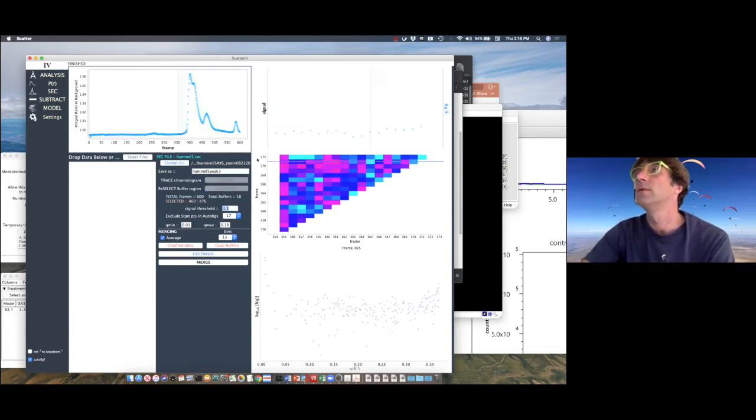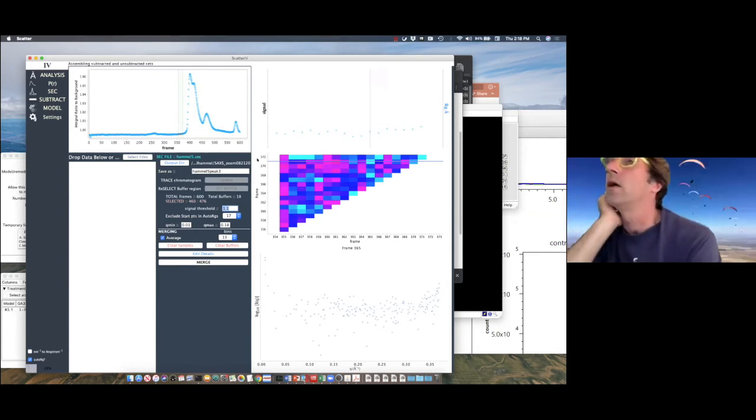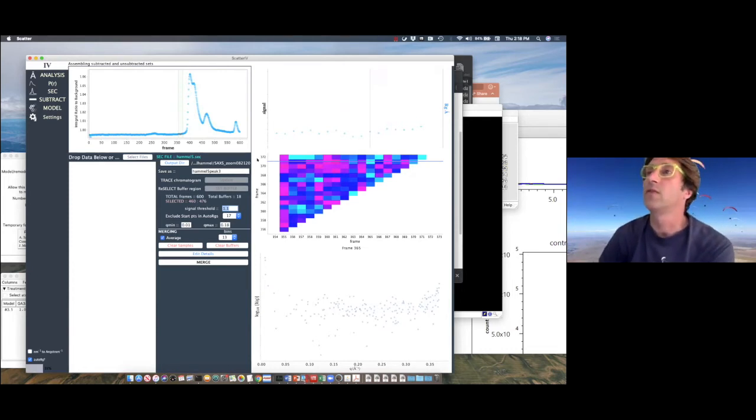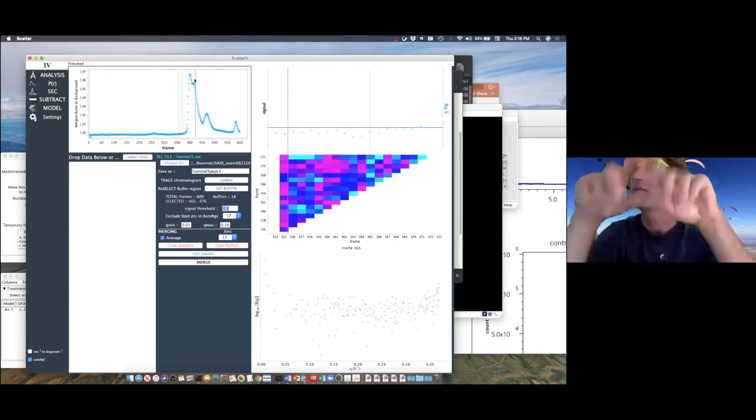Update it. Do you think it would be worth trying to run that on a different column? We are on the way to do it, because on SuperDex there is not a split peak. This is a problem with the SHODEX sometimes. We have high pressure columns, but it also tells you the complex is very transient, it's not stable. And so we want to separate those anyway. But on a SuperDex, there is no split at all. It's kept together. And in our SHODEX column we see the split, and we see it also in hydrodynamic radius and light scattering as well. So there is an indication that it's not a stable complex.